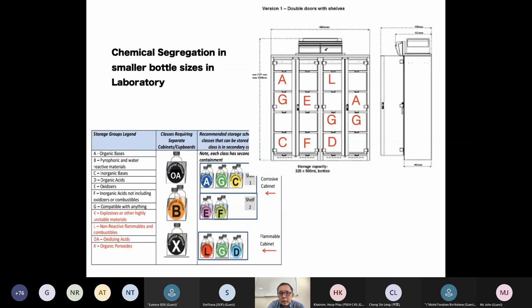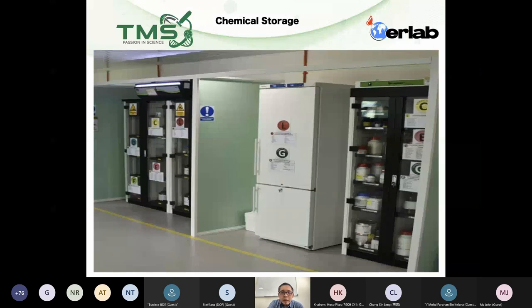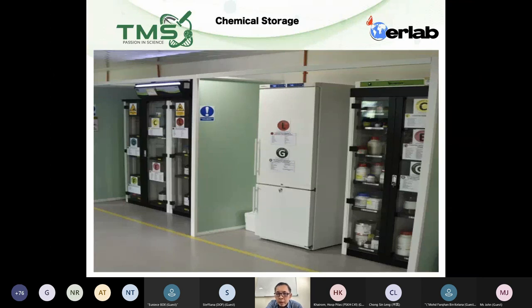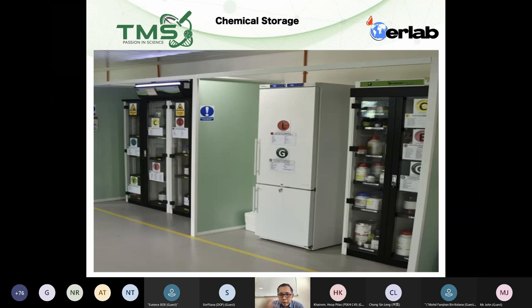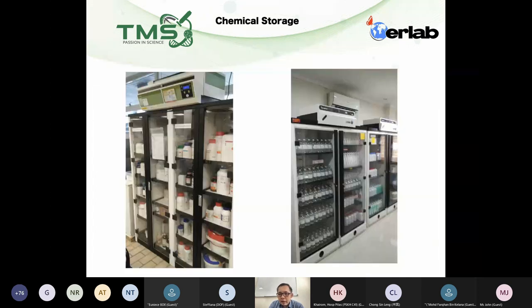I want to show a great example from one of my customers — UTP, Universiti Teknologi Petronas. You can see they placed groups L and G — solvents and non-intrinsically reactive solutions — in a chiller and storage cabinet, with the rest properly arranged as D, F, C, E and so on. This is a well-implemented example of proper chemical segregation.